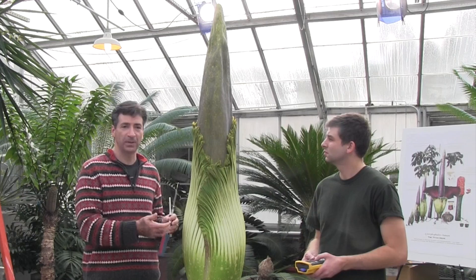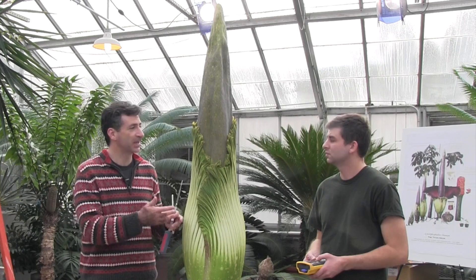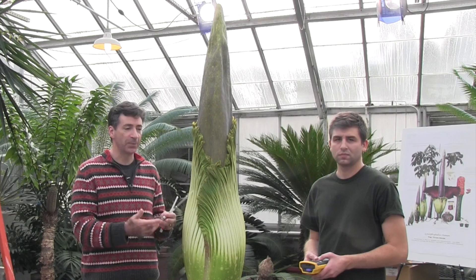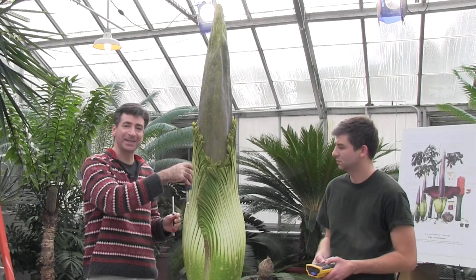What's really interesting about this is that usually we enclose a flower — they're always smaller than this — in what we call a headspace bag, an oven bag, say one that you would bake a turkey in that doesn't have volatiles of its own. We let the volatiles accumulate and then we collect them over a little trap, like a cigarette filter but much smaller. We're going to put a little filter on the battery pump and then suspend it into the floral chamber, where a lot of the volatiles are being produced.